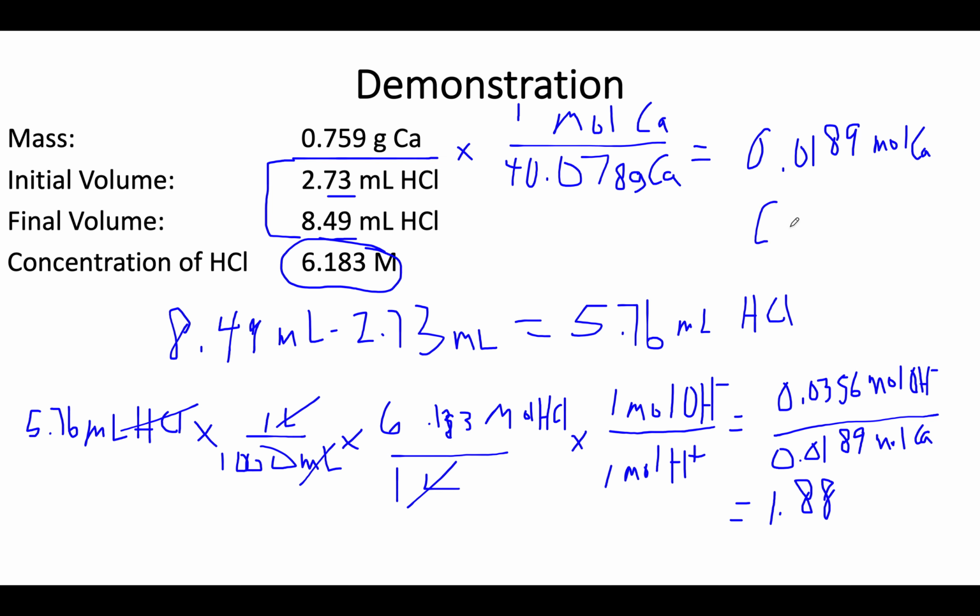And again, as I alluded to, you probably know, because hydroxide is a minus 1 polyatomic ion, this is the formula. So if you turn in and say, well, the ratio is 2, no, the ratio is 1.88 in this experiment. Okay, we want to know what's the quantitative calculation from the data in the lab, not just, oh, because I know the charges and that's how you put them together.